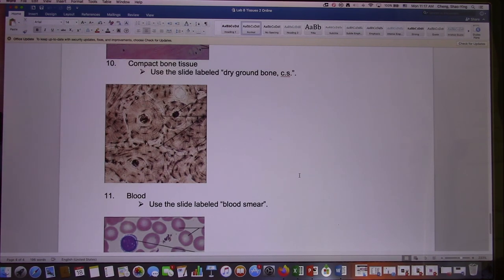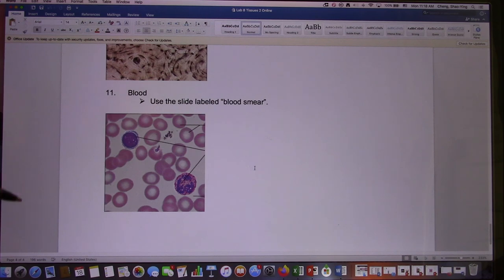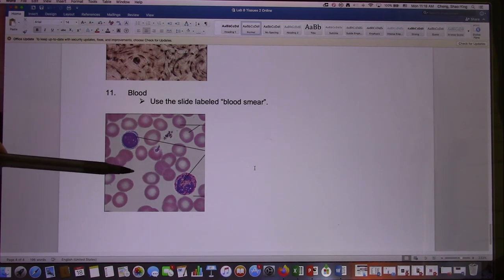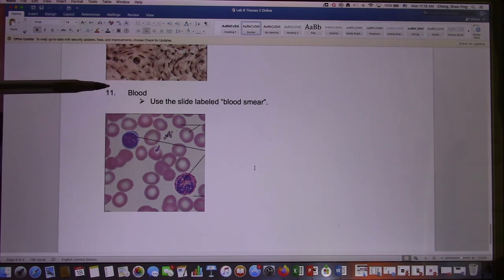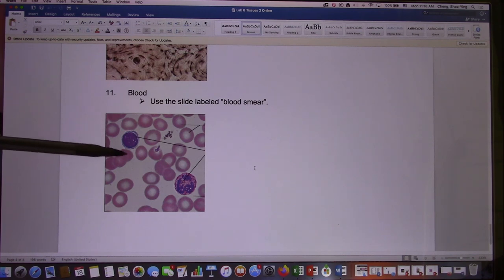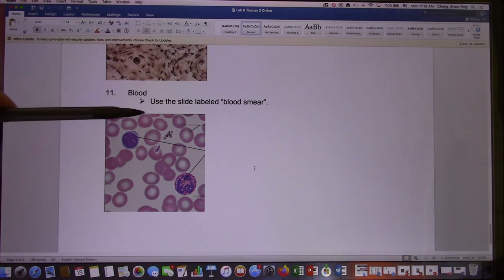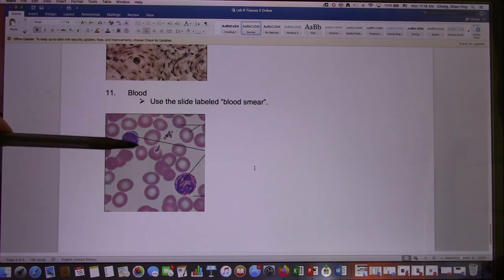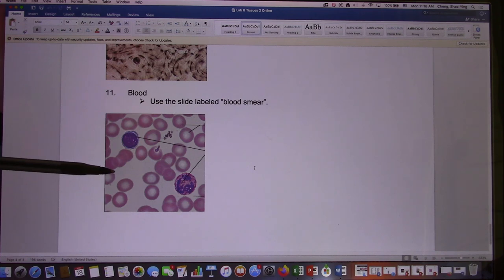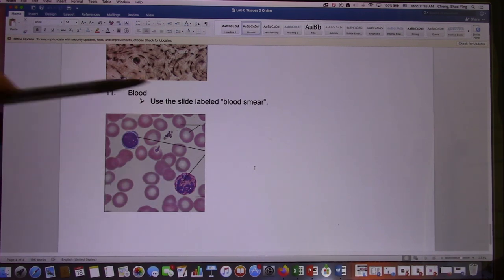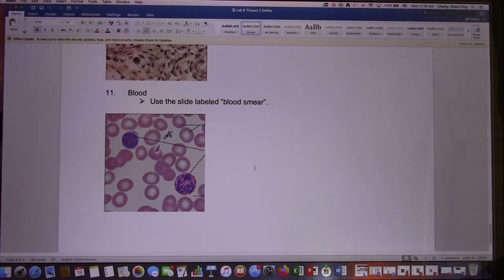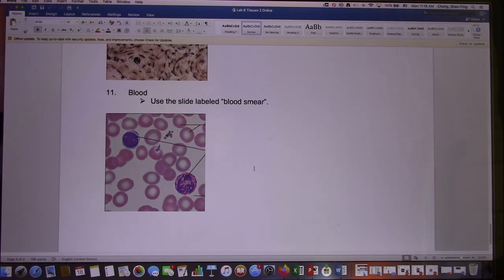And the last one: blood. Blood is a very watery connective tissue. These are the plasma — plasma is mainly water — and these are the blood cells. 99.9% are red blood cells, so all these are red blood cells, and these two are white blood cells. If I give you this slide and ask you what kind of connective tissue it is, this would be pretty easy — the answer would be blood.